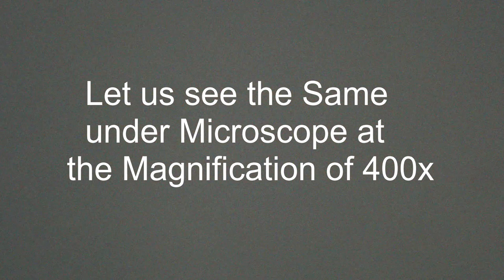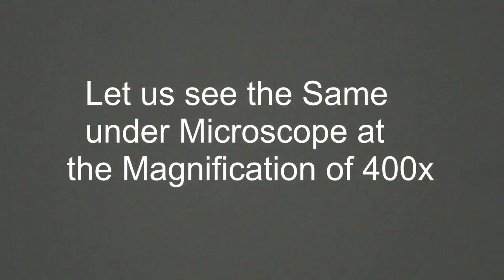Now we are going to a higher magnification at 400x under a normal compound microscope, an optical microscope.